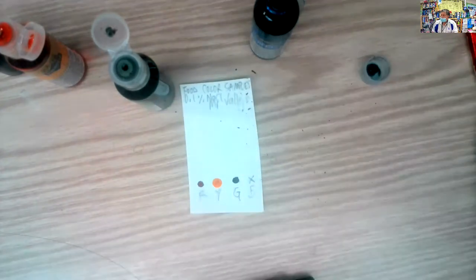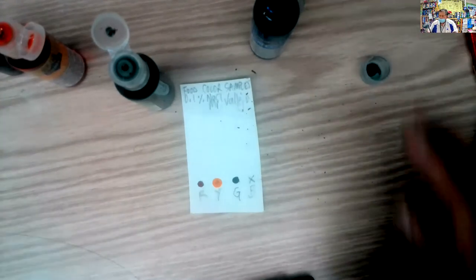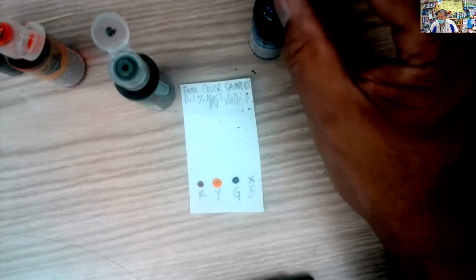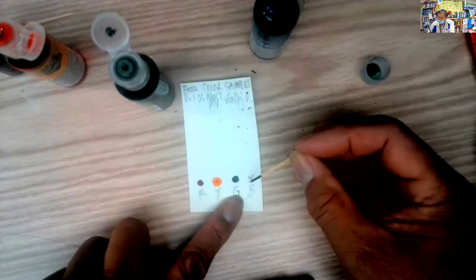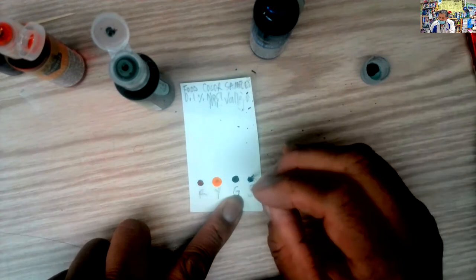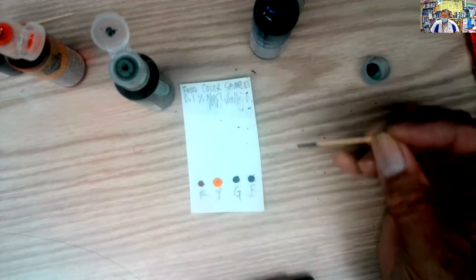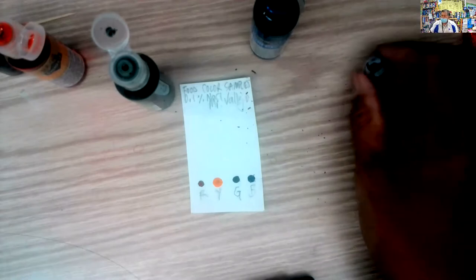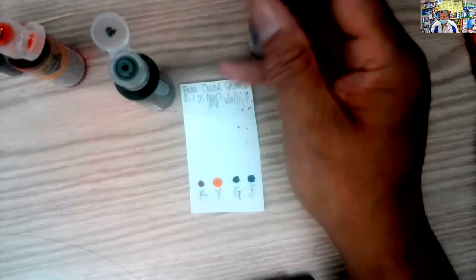Okay, here's the green. And then one more I have is the blue. So I'm going to take the blue and touch that to the paper also. And just touch that. And there's the blue one right there. All right. Looks pretty good. And they're all fairly equal as best I could do.